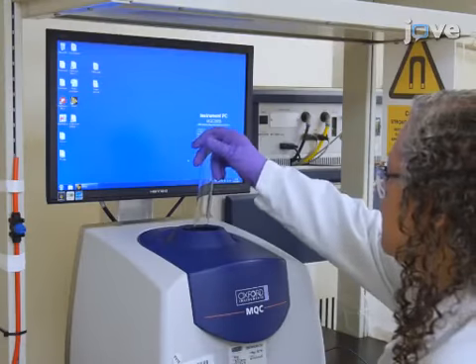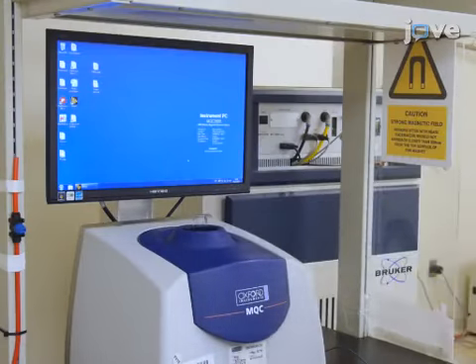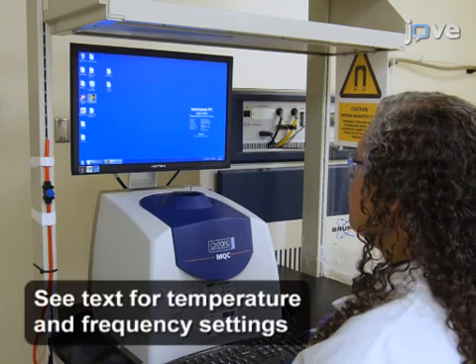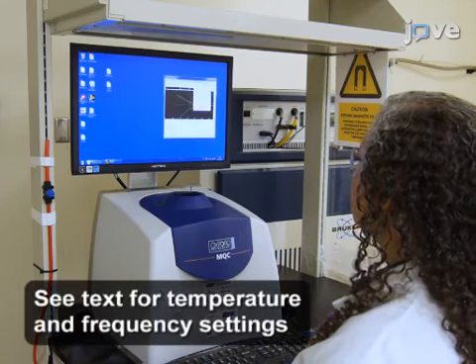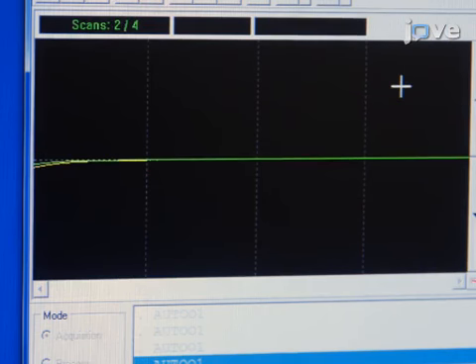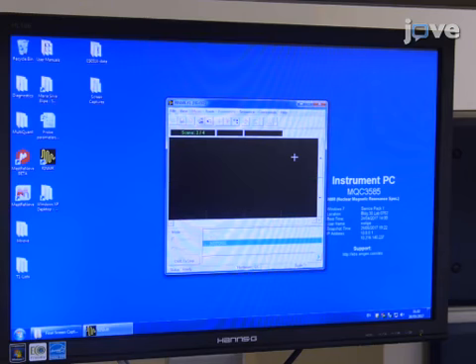Place the NMR tube into the probe inside the magnet. Allow the tube to equilibrate for 5 to 10 minutes before tuning the instrument to F19. Select Auto O1 under the Commands menu in the NMR software. Repeat the measurement at least 3 times and take the last value of the O1 parameter.